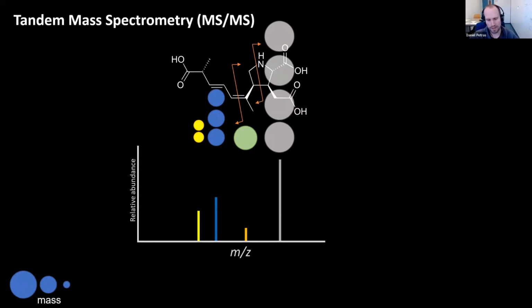And we could be already pretty sure that this is likely our molecule candidate there. If we don't have that available, we can use MS-MS to also de novo propose the structure, especially for peptides. This has been done, or is still done, very nicely, because peptides.